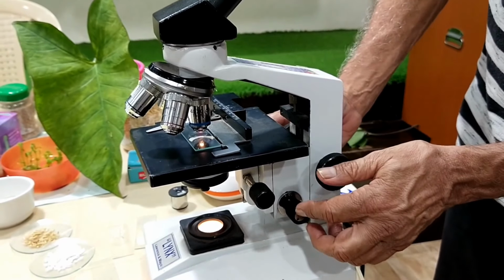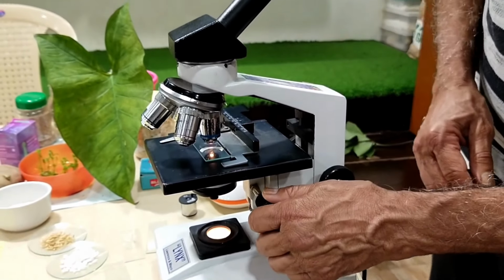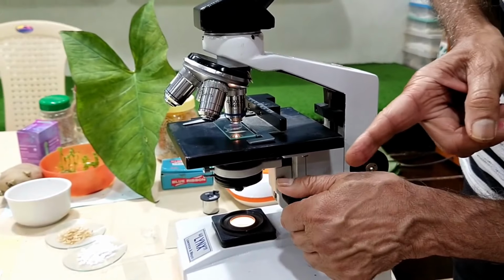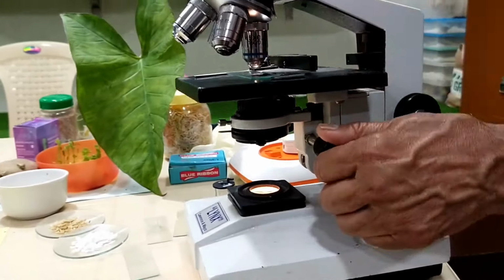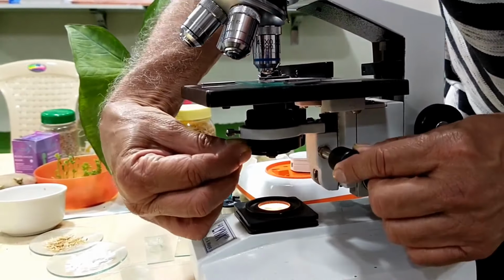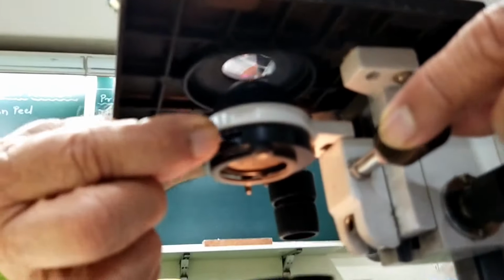That's fine adjustment. This piece here down below is what is called the condenser. Here is a condenser. And that's a lens again, and there is a diaphragm for the condenser. Can you see this knob? This is a diaphragm for the condenser.